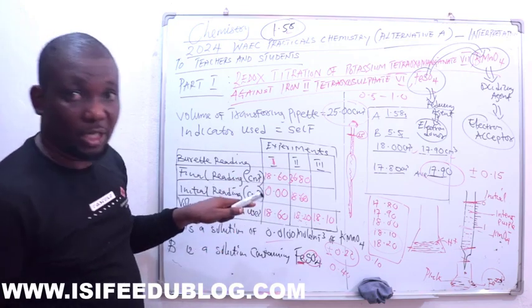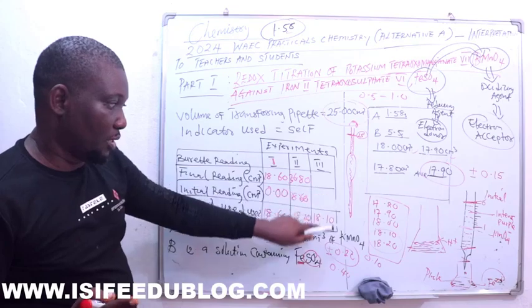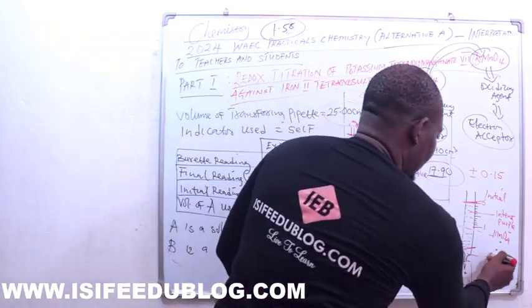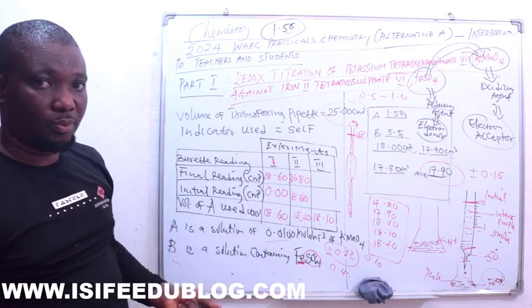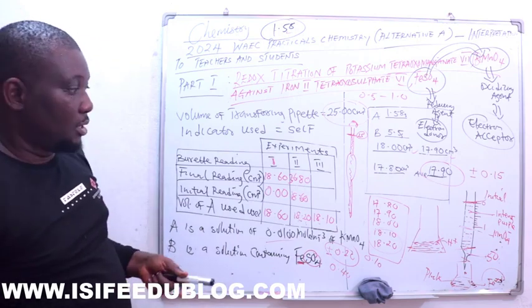At this point, you're not encouraged to use this here again, because the sum of this will be beyond the capacity of it. The capacity of this is 50. So I don't think adding up this to get this works. It shouldn't add up. I don't think you can do the arithmetic later, and possibly I'm trying to see if the arithmetic can work.